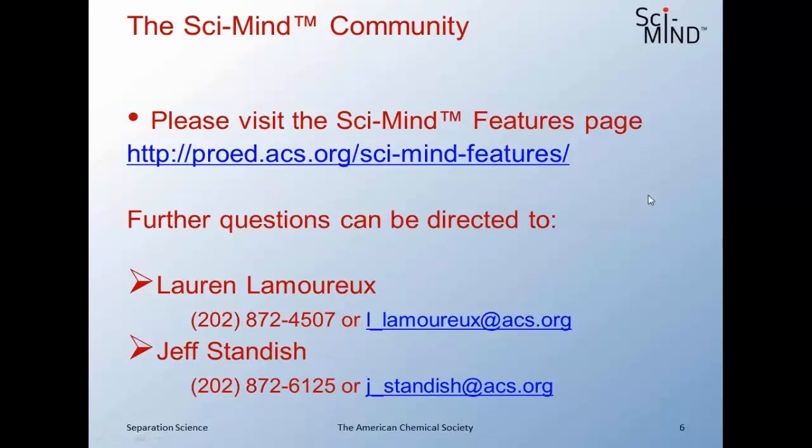There are some that are sold for that purpose. Not utilized tremendously. I need to do some. I have small amino alcohols. They seem volatile, so I was thinking maybe GC would be a better approach, and they're very small, near or less than 100 molecular weight, and it tends to be problematic even on my SFCs.